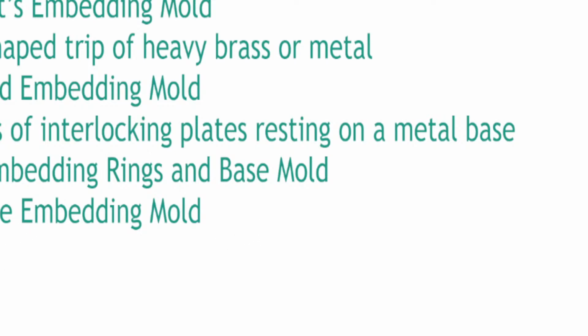Now, what do we need to remember when it comes to embedding? The orientation. I can't emphasize this enough. The orientation of the specimen is the most important thing that you need to remember when we're talking about embedding. The tissue is arranged in a precise position in the mold during the embedding process, on the microtome before cutting, and on the slide before staining.